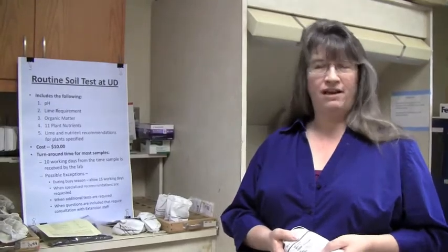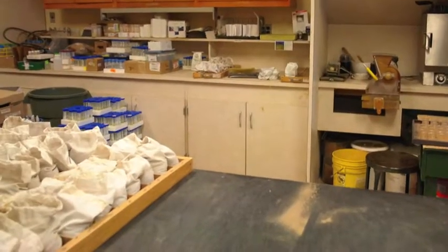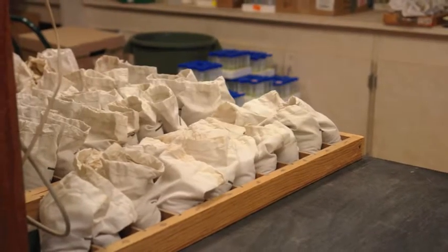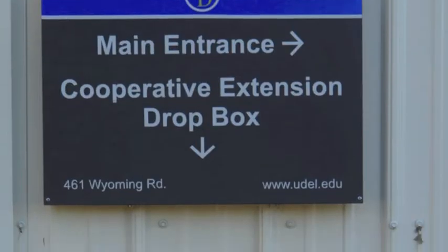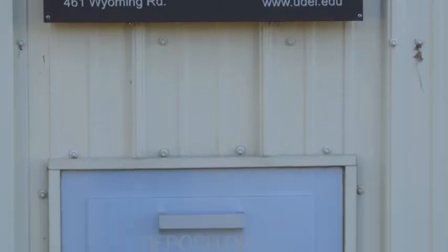We do about 20,000 samples a year. About 5,000 of those are soil samples, such as the ones you see on the counter. When you have your sample that you've taken in your yard and you send it into the university, this is where it's going to get delivered. You may drop it off at a post office or a cooperative extension office, and either way it's going to make its way here.